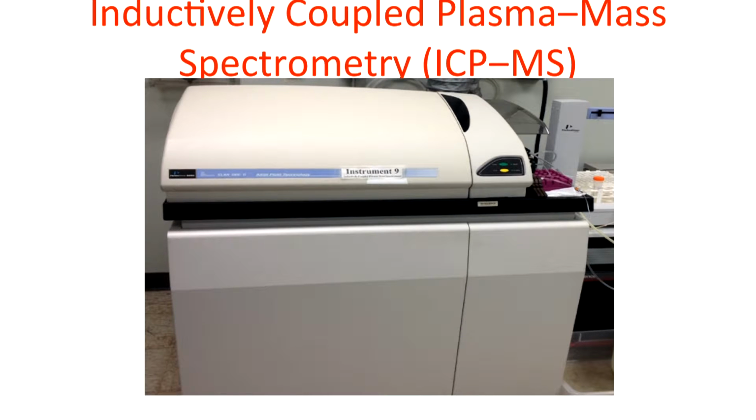So the next instrument is called inductively coupled plasma mass spectrometry, or ICPMS for short.